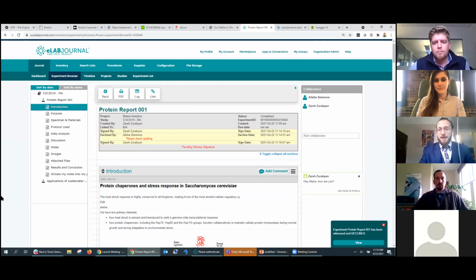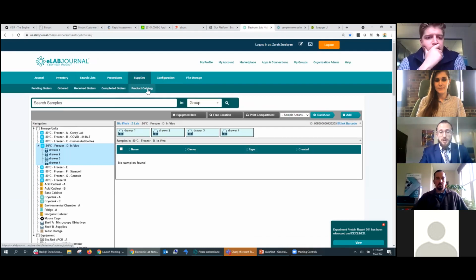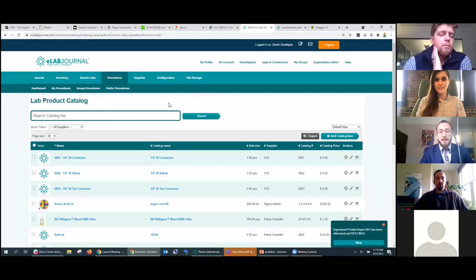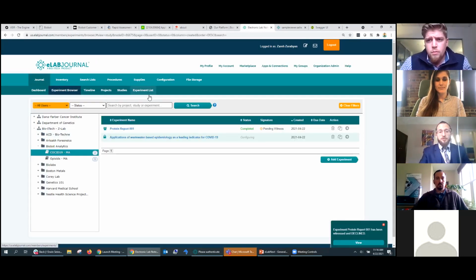But just to recap everything, what we basically did is we created our inventory, our storage units, our samples, our equipment, and our supplies. Then from there, we went into our procedures and created the protocols needed to utilize our storage units, our equipment, supplies, and so on. And then lastly, we went into our journal and created our projects and studies and reports and pulled the information from all these other modules into this one comprehensive reporting tool with full audit trail as to who did what, when, and kind of just gave it to you in this view to easily access. And that in a way is the summary of the system.